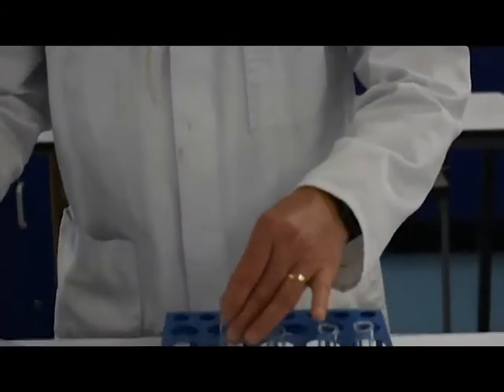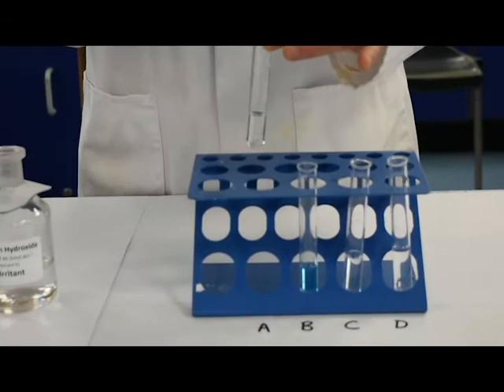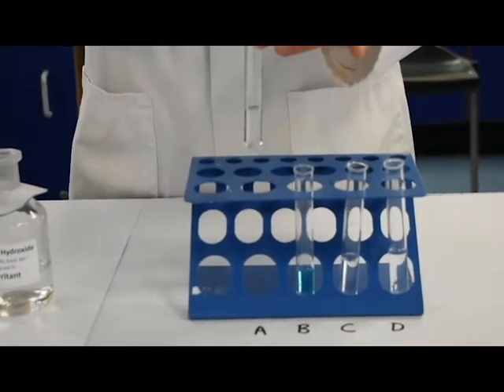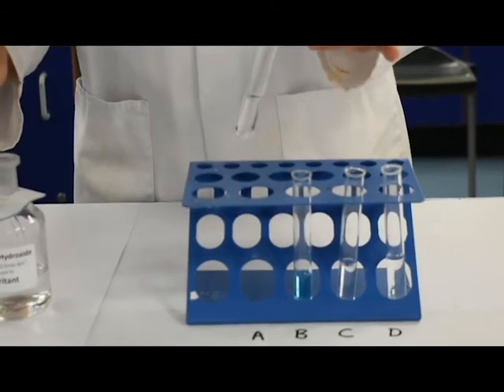Hello, my name's Alan. I'm one of the chemistry teachers here at QE. Just going to take you through the tests with sodium hydroxide for solutions A, B, C and D. Okay, so here's sample A and a little bit of sodium hydroxide going in there. A little shake. Don't forget to write down these results in your table.